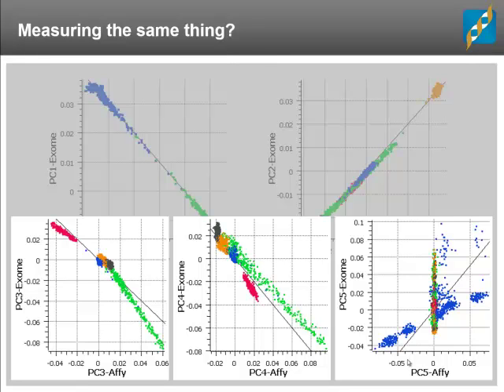While if you looked at the exome data, univariate as a histogram, it would be more of a smooth curve that's detecting some other difference that is more uniform across all of the samples. They're clearly detecting different effects. I might have to dig into it a little deeper to learn exactly what it is.